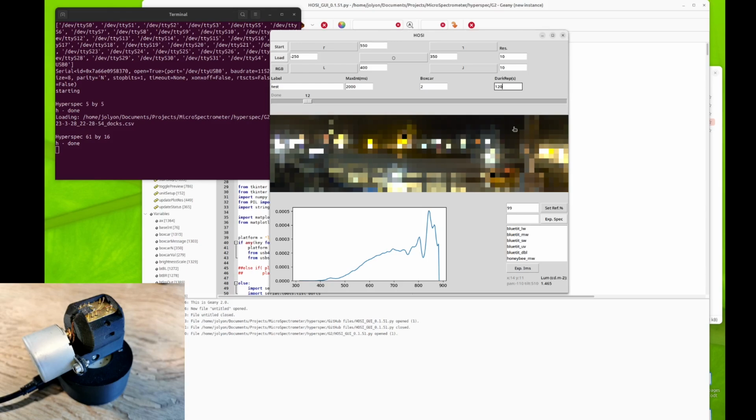And if I just want to extract these spectral data, that's actually really easy. All we need to do here is I can write halogen and then click export spec. And then let's click on that high pressure sodium, and I can write in HPS, export, and then how about this LED, export spec.